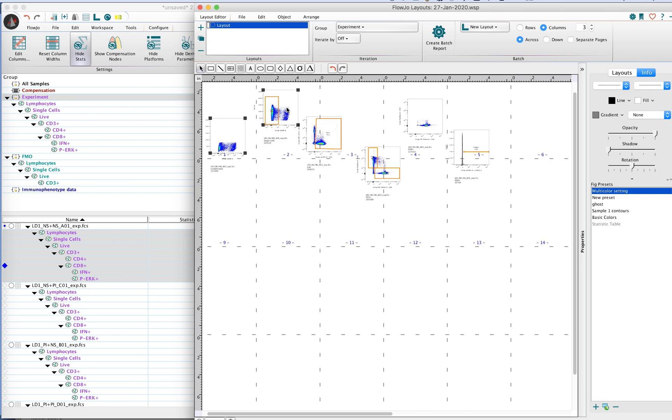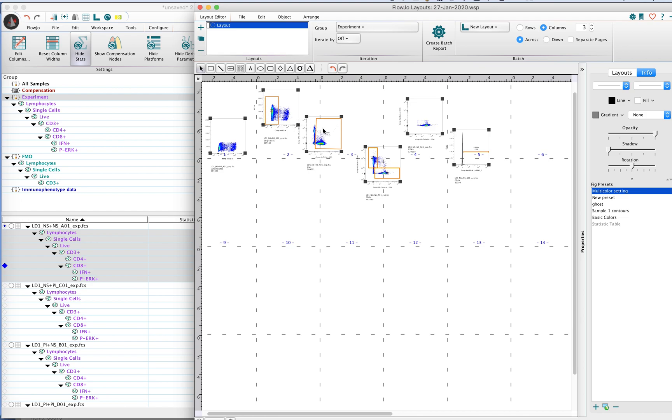To align the plots, there are several different types of tools. You can do a Ctrl+A which will highlight all of the plots for you, or you can hold down the Ctrl or Command key and click on each plot individually.